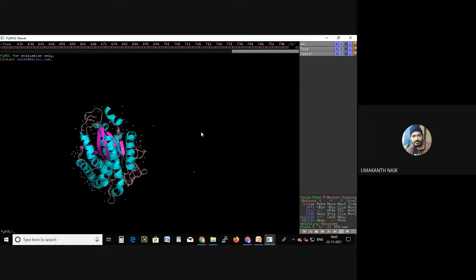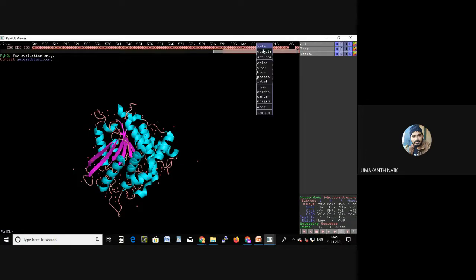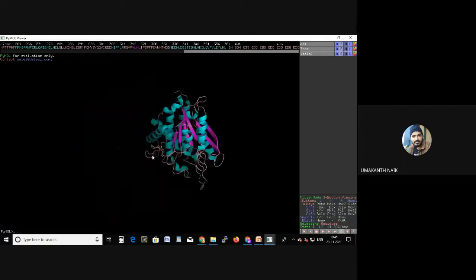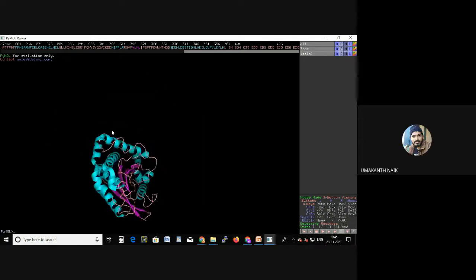There are some dots available. I also remove them. You need to observe something different when I'm doing everything, so later on you will be able to understand what I'm doing. So I have removed everything now. Got it? Yes, I have removed everything.